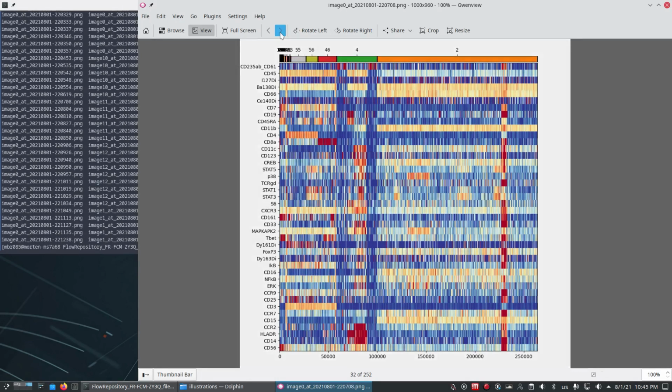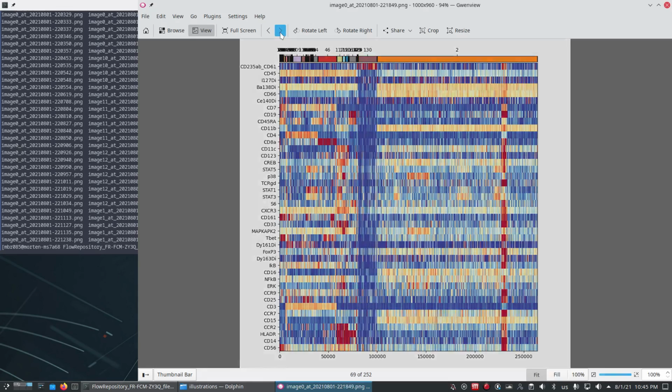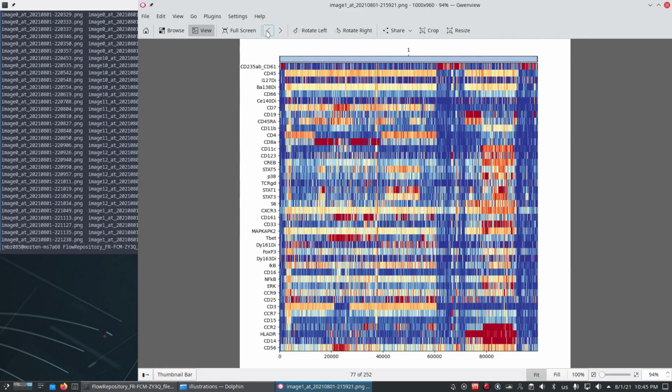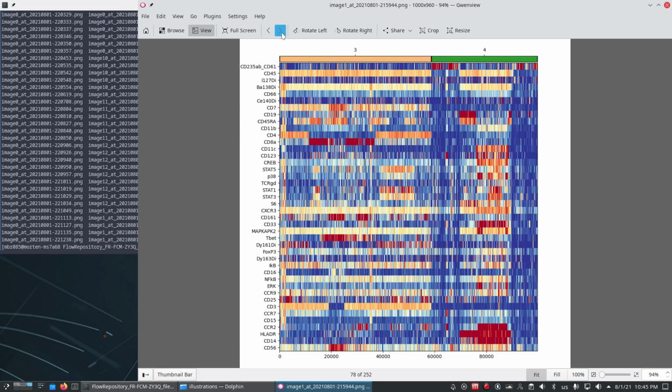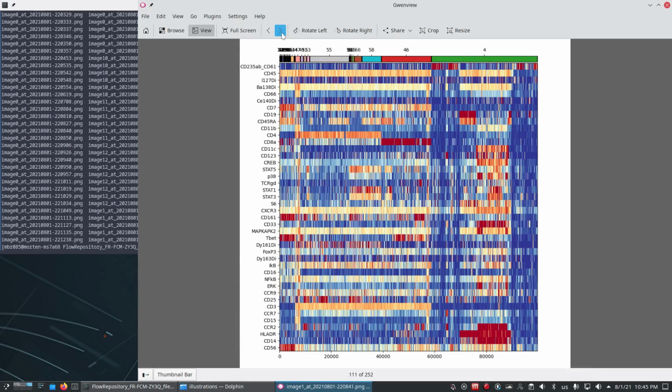And here we get the whole history of how I gated or split up into clusters. And now what I did here is I said, okay, here I have the illustration for cluster 1, how that was split into smaller pieces. And it's pretty much the same, only we don't have all the things to the right.